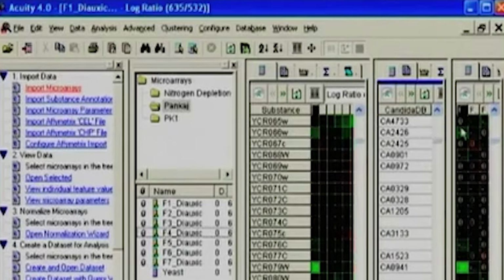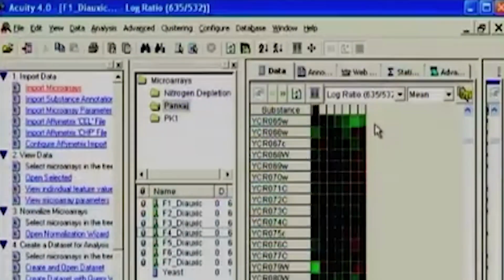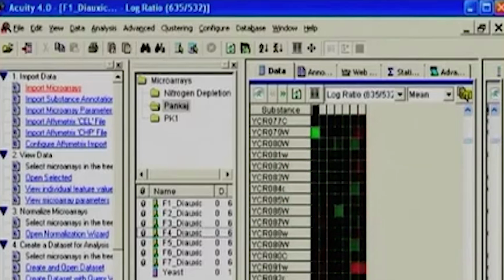So there is enough opportunity for you to play around with how you want to look and customize your view. I think these types of heat maps right away give you a feel about what types of genes across each time point have shown variation or modulation in the expression profile. Looking at the color itself, for the first one I can easily say it is going down as we are moving across towards the 20th hour. So by looking at this type of data, one can visually get a feel for the expression changes across the different time points. This gives you an immediate visualization tool to understand what is happening and get a rough idea.